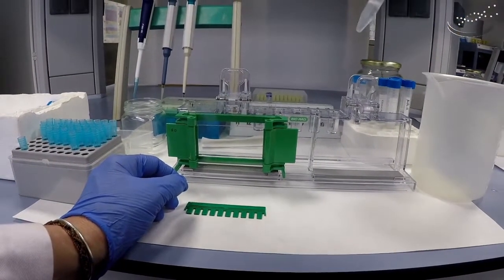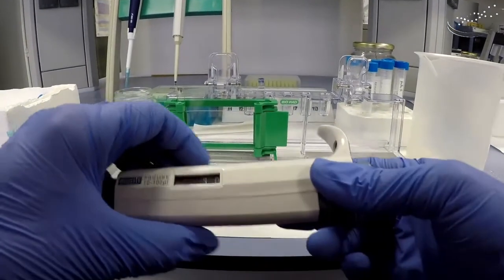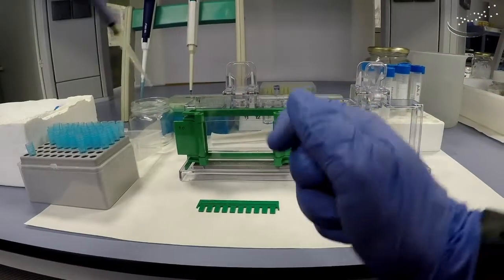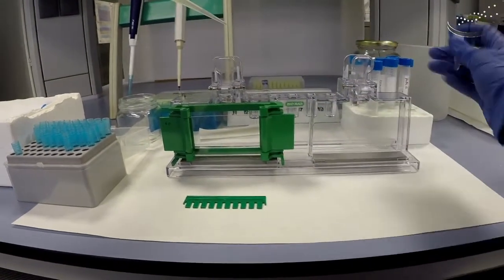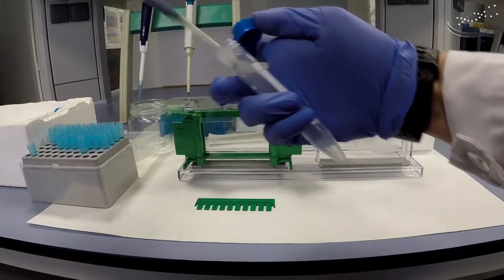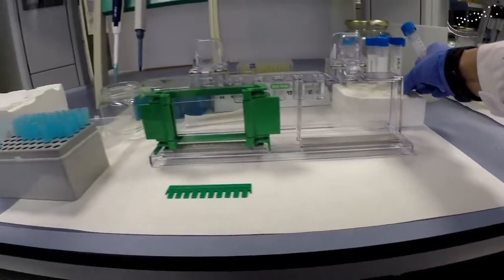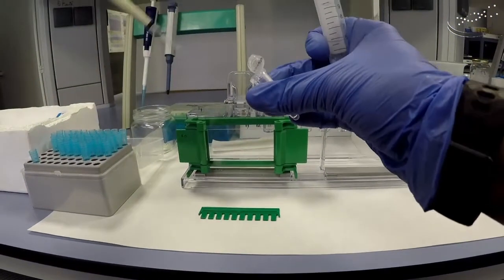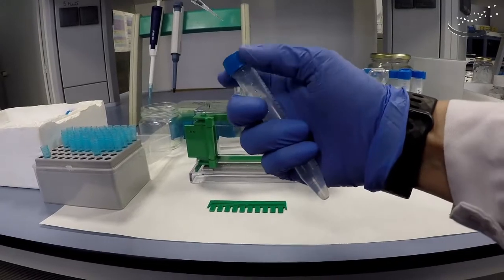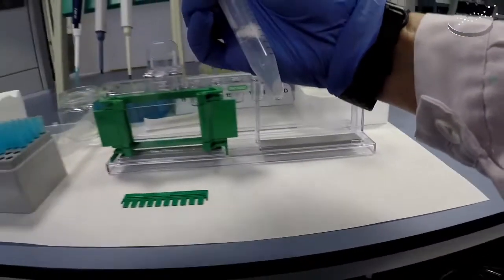Here's the stacking gel — the mix with buffer, acrylamide, and water already prepared. We're going to add 30 microliters of APS, then 3 microliters of TEMED. Start with the APS: pipette the volume, insert your tip below the level of the liquid, and dispense. Cover and mix to avoid local concentration of APS plus TEMED plus acrylamide. Now 3 microliters of TEMED — very similar to the resolving gel, just different amounts. Insert the tip below the level of the liquid to pipette all of the volume in, then mix again.